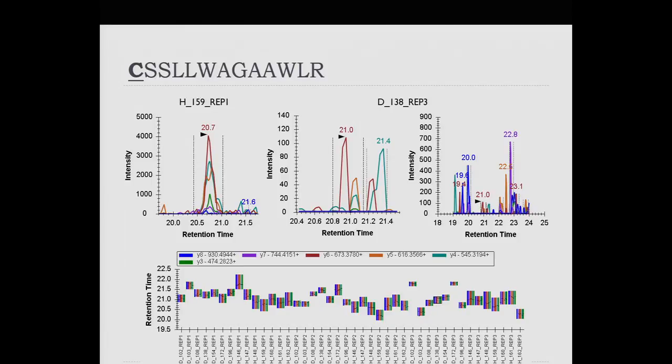If we drill into the chromatogram level, we can see that most of the healthy candidates look like this, which, while it's not a beautiful peak, and it might be very close to the lower limit of quantification, definitely, that is a peptide. And it's repeated over and over again, and so I feel pretty confident that in the healthy, we're measuring a peptide. Whether we're measuring exactly this peptide, I can't say.